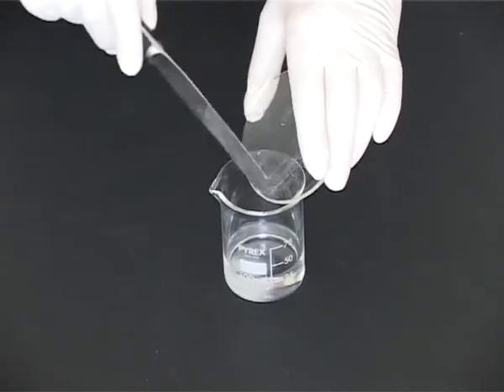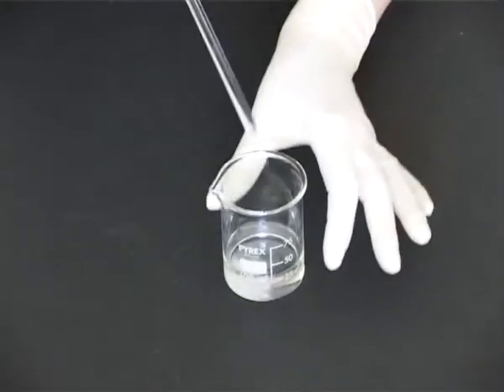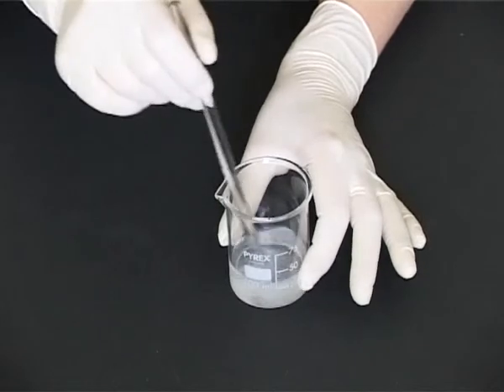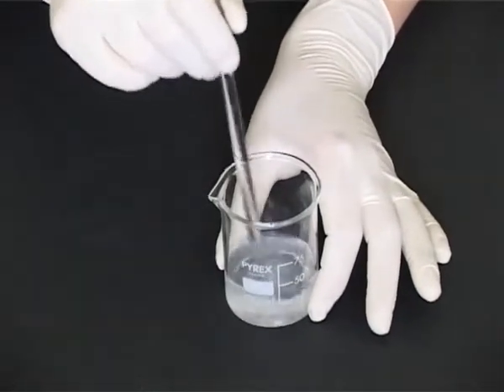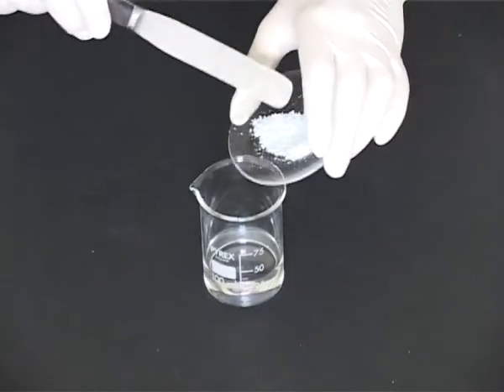Add solute to the beaker in order of solubility — that is, the least soluble first — and stir to make a solution. Repeat with the next most soluble ingredient.